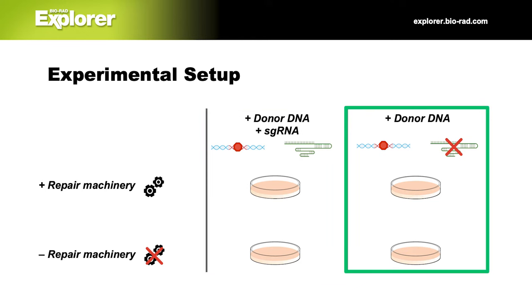While your bacteria is chilling on ice, label your four XSPT plates A, B, C, and D. You can also add the date and your lab group's initials or group number. Set your P200 pipette to 100 microliters and put on a tip. Flick the A tube a few times, then transfer 100 microliters to the A plate.